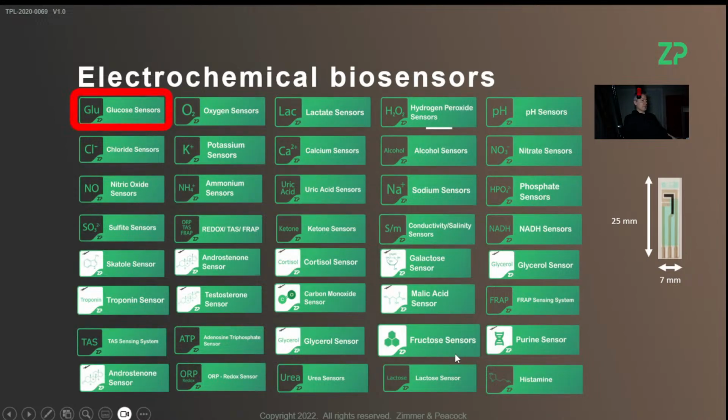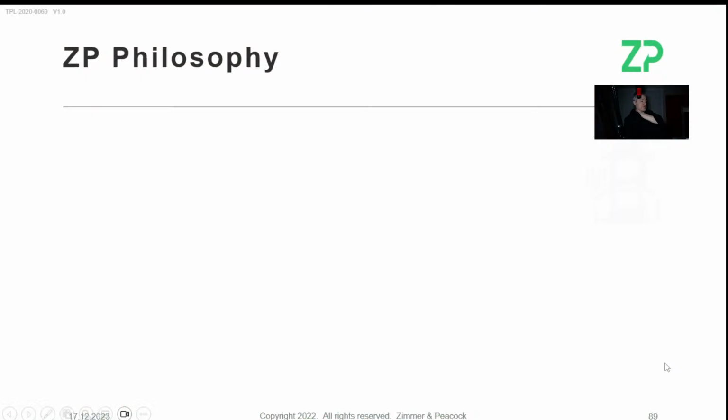So we have glucose, oxygen's on your list, lactate's on your list, sodium is on your list, potassium is on your list, and pH is on your list as well. So I just want to cover that we actually do have those sensors.